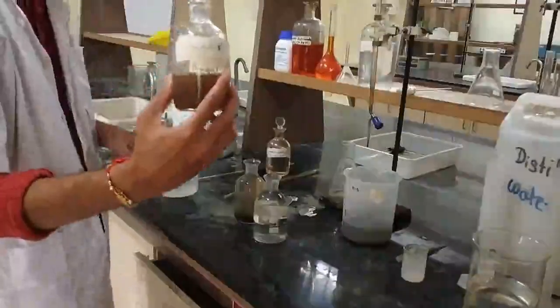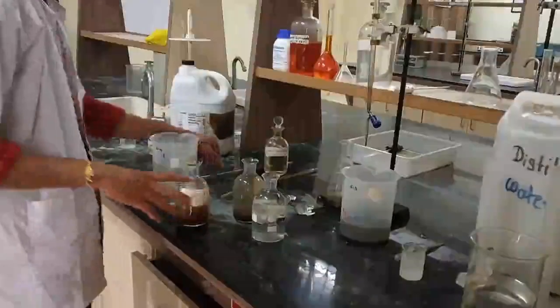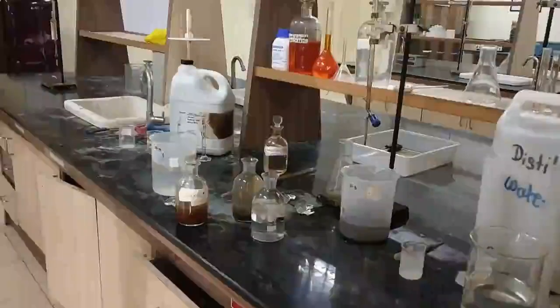Firstly the manganese sulfate, 2 ml in each bottle.